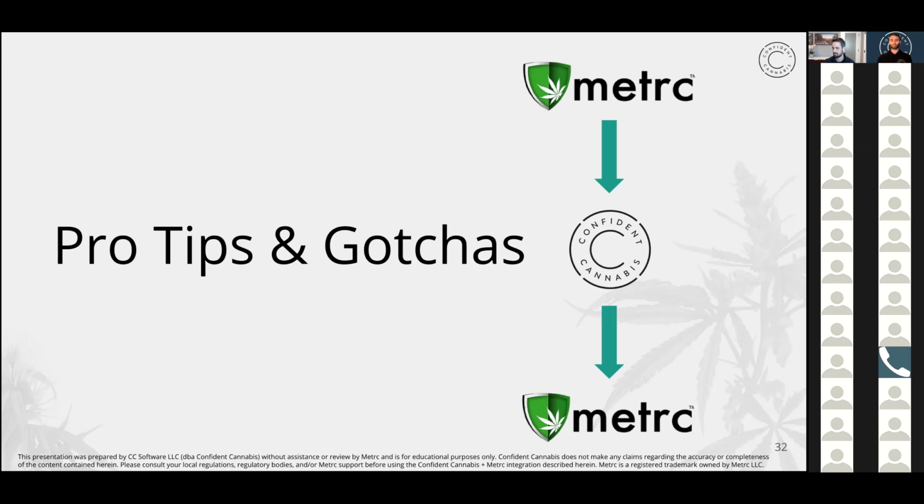But in the case where there's a big difference, like 10 versus 5, you should reject the transfer and then have them recreate the transfer for 5 so that it matches what you take. And then that way they're on the hook to account for that missing 5 grams, right? Now, once you take possession of it, if it's your lab's employee who's driving it, obviously, then you'll want to do that weighing and that accepting of the transfer beforehand. But I think the question was, how does that canceling of a transfer, rejecting of a transfer affect Confident Cannabis?